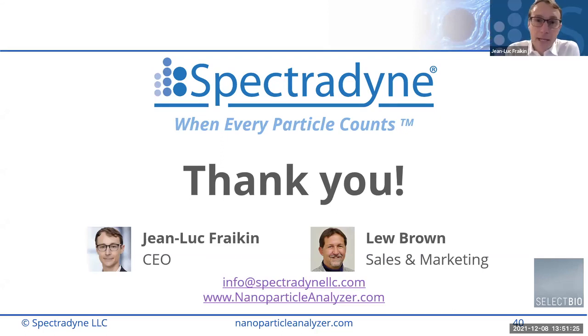Great questions. Thanks, Barbara, and thanks for attending today. The question about shape is a really interesting one. The primary measurement that our technology makes of the particle as it goes through the constriction is to measure the volume of the particle. So to first order, we can't distinguish between particles of different shapes.